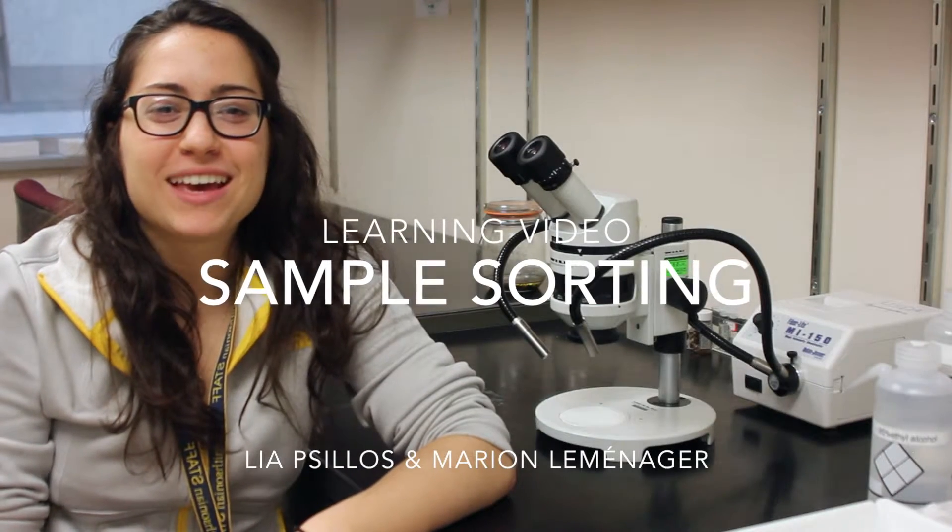Hi, my name is Leopselis and today we're going to be learning how to sort through a sample collected in the field.